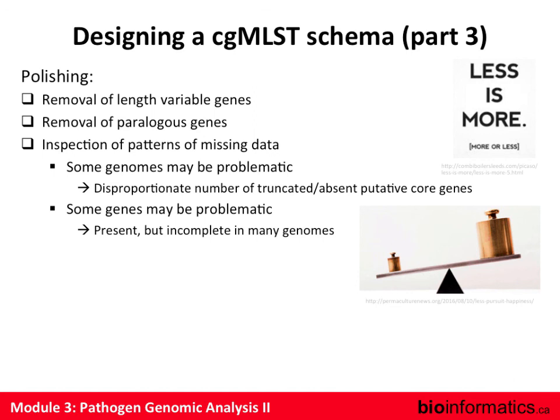Now, here's the good news. A lot of work goes towards the development of a cgMLST scheme. The good news is that it probably won't be your job to do that. It's going to be some poor guy's job to design a scheme, and you will get the benefits of all their hard work, of being able to use that scheme, and it's amazing. But they spent all this time building it just so that it's amazing. It takes a lot of work.